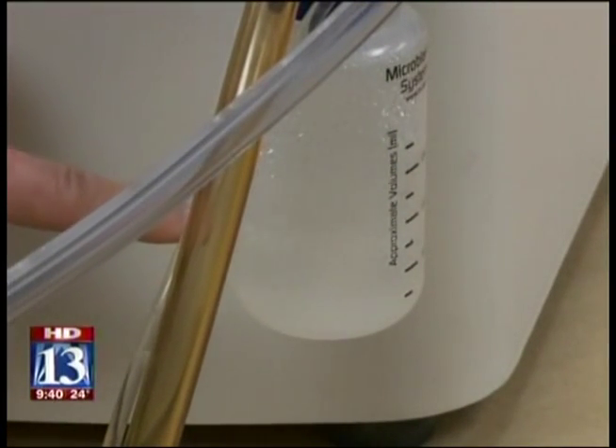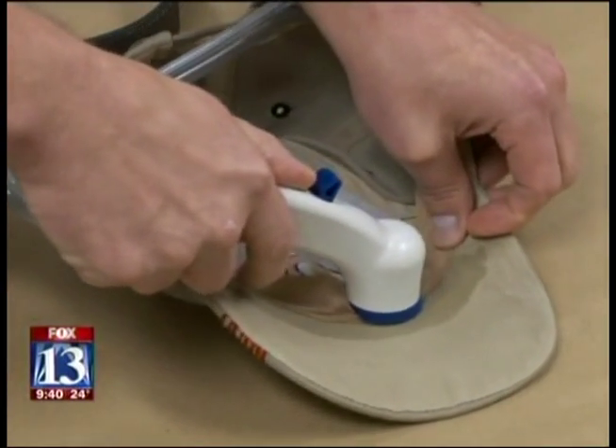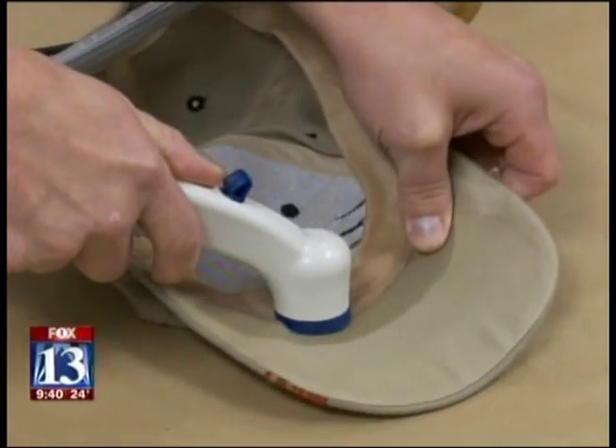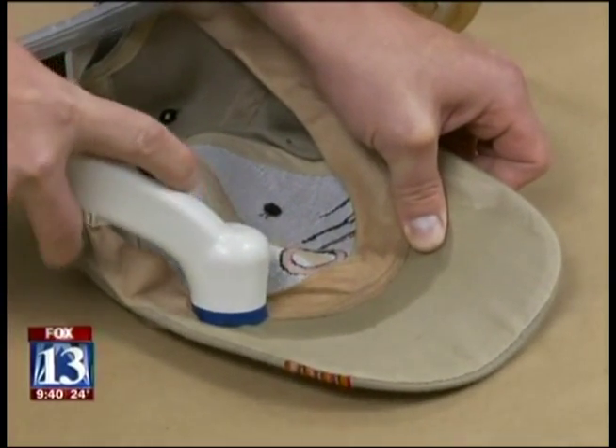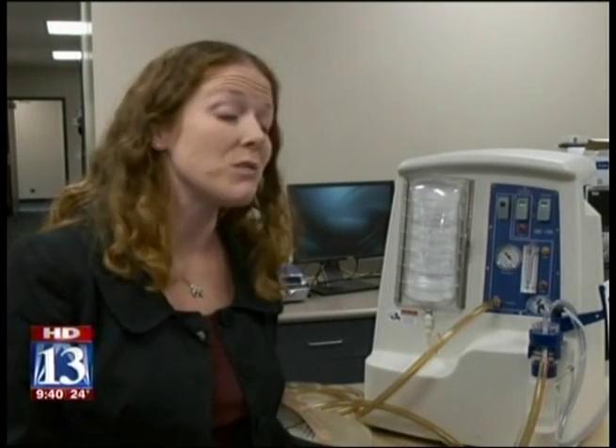Currently, the time it takes to process for DNA is fairly significant, and we want to be able to help in some way so that we can get results a little faster than what we're getting them. The vacuum picks up 40% more DNA from a saliva stain on polyester than a cotton swab does, and 88% more from a blood stain on nylon fabric. You just increase your opportunity of being able to get a full DNA profile from that piece of evidence by being able to collect more with this type of technique.